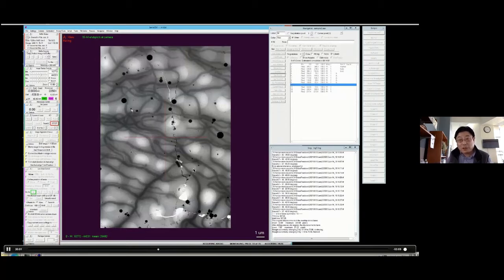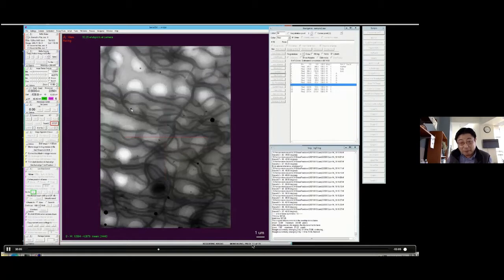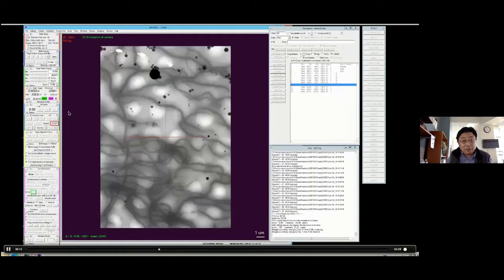So this could be a longer time. And this, as I told you, is 15 images. It's about 3 minutes per montage. And you will see after they finish this one, you are getting the first montage.